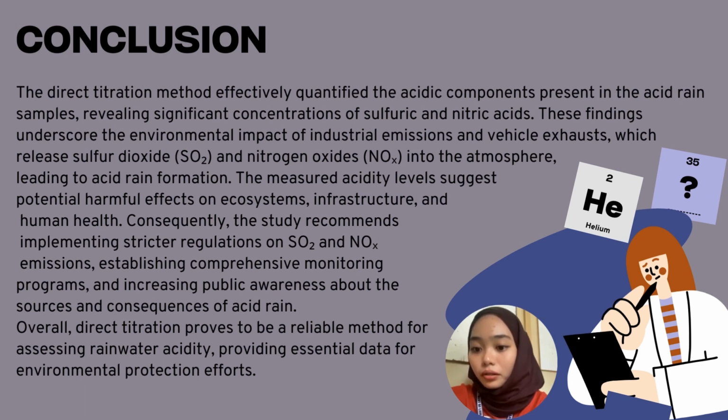So overall, direct titration proved to be a reliable method for assessing rainwater acidity, providing essential data for environmental protection efforts.